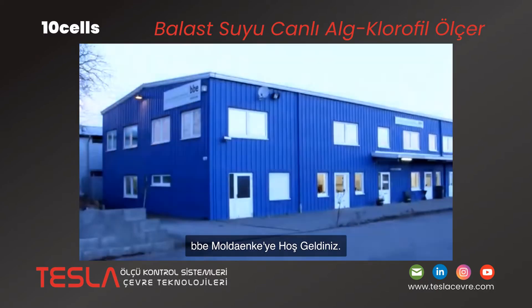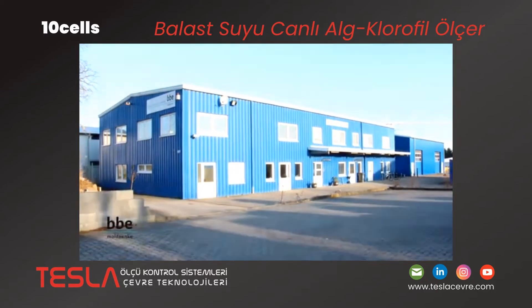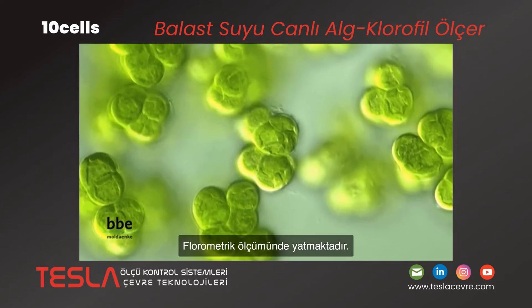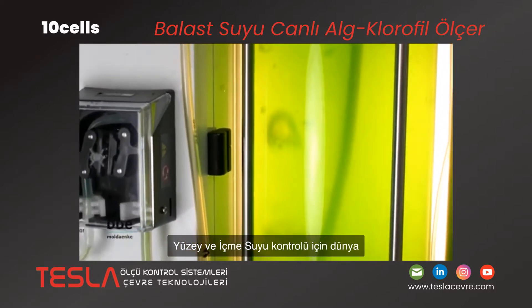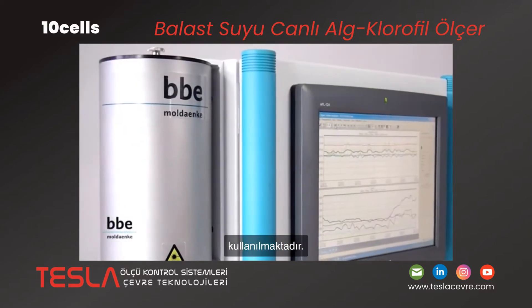Welcome to BBE. Our company is located in northern Germany. Our focus lies in fluorometric measurement of algae in water. For more than 20 years we have been developing and manufacturing fluorometers. Our high quality devices are being used worldwide for surface and drinking water control.